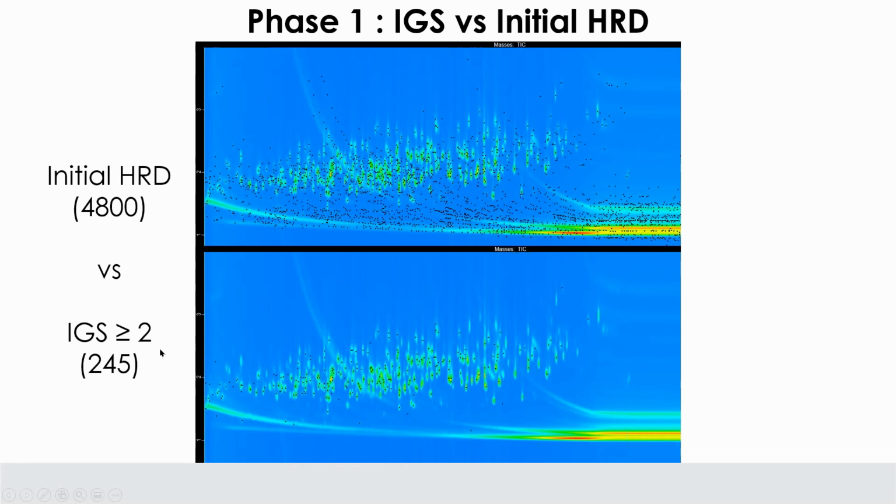I'll often do this when I'm looking at non-target data, and then I'll make another pass where I lower the filter value to less than 2 but greater than 0. That lets me look at the more borderline cases. Anything below that, I probably don't ever look at, because generally there's not a library match unless there's something very interesting I want to dig into later. But if all we're trying to look for is library matches, this tool is very effective at quickly screening out the chaff and letting you focus on the best information right away.